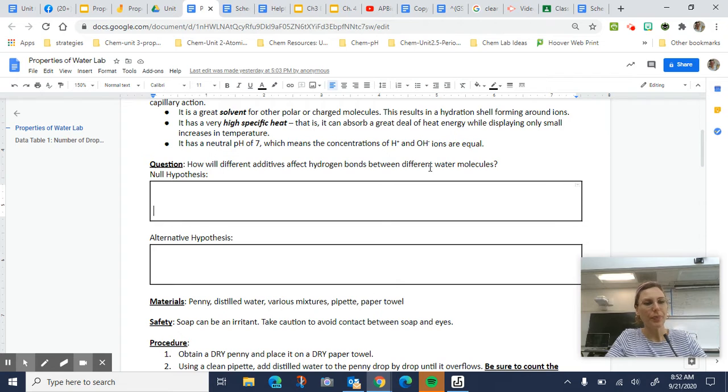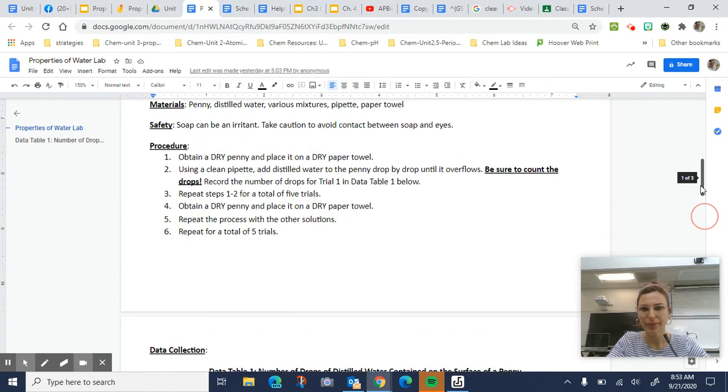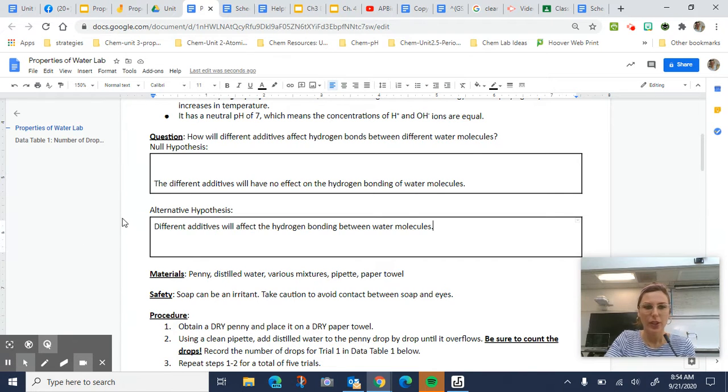I'd like for you to pause the video here and come up with your null hypothesis. How do you think the different additives will affect the hydrogen bonds? To help you with that, here are your four different liquids: regular distilled water, distilled water with soap, distilled water with sugar, and olive oil. Think about what your null and alternative hypothesis would be. Pause the video, and then I'm going to give you those. So let's take a look.